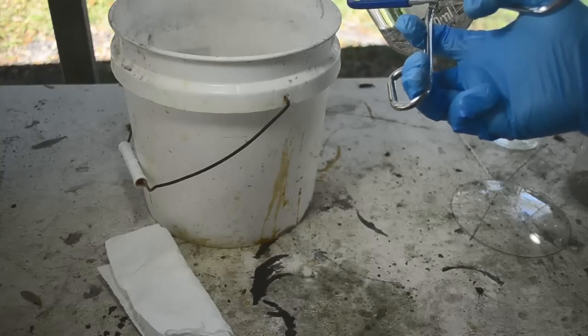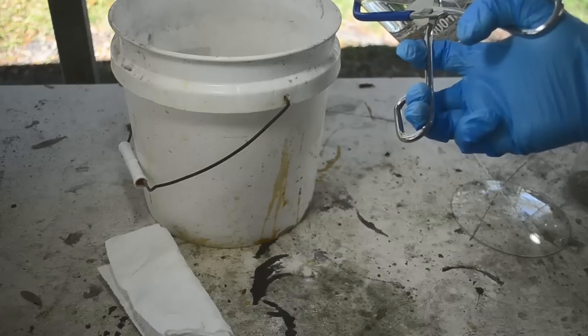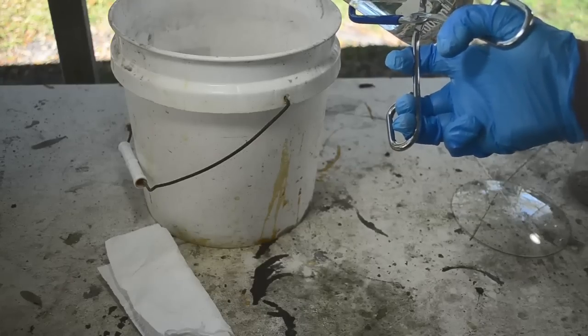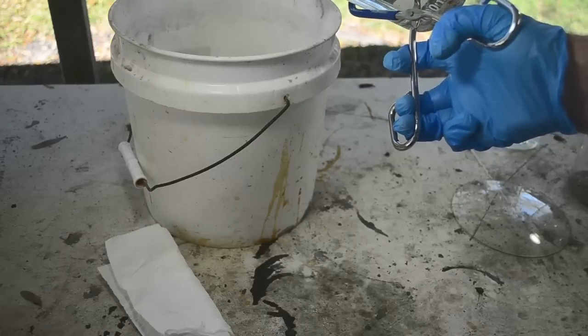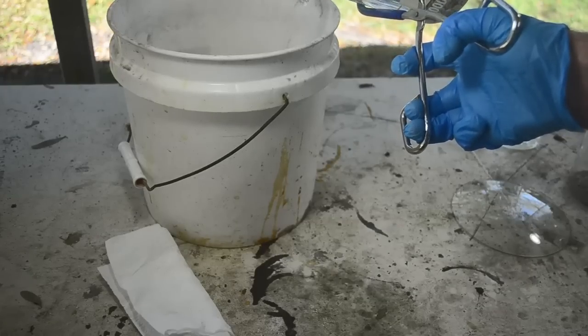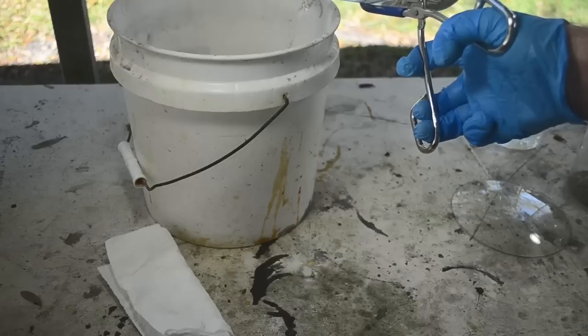Now, if we were converting any copper to copper chloride, it would probably be a little green. Maybe I'm just not seeing the green tint. It might be slightly green. Maybe the blue of copper nitrate is showing up better. I don't know. Or copper sulfate. Maybe the blue of copper sulfate is showing up better. Because copper sulfate is very blue.